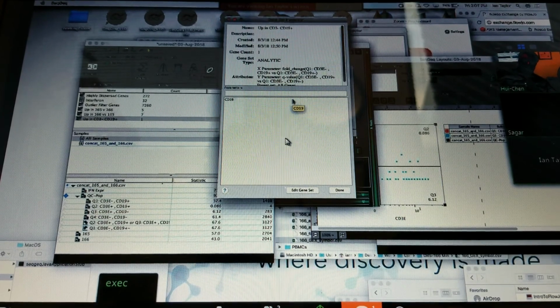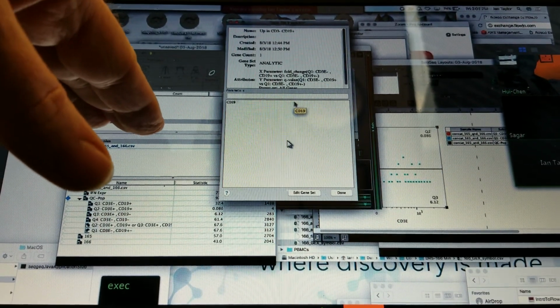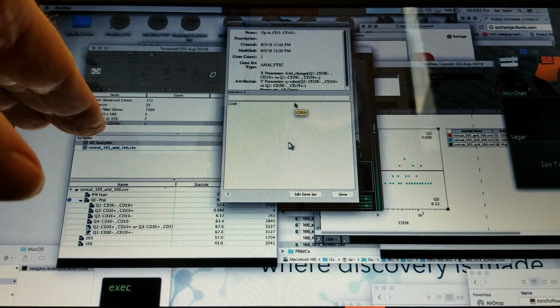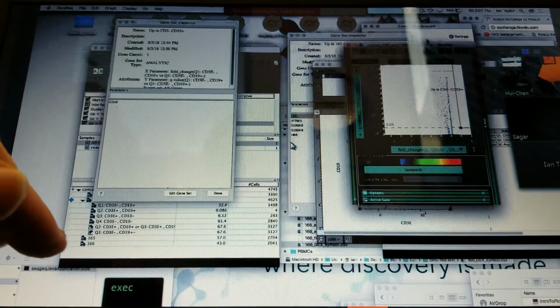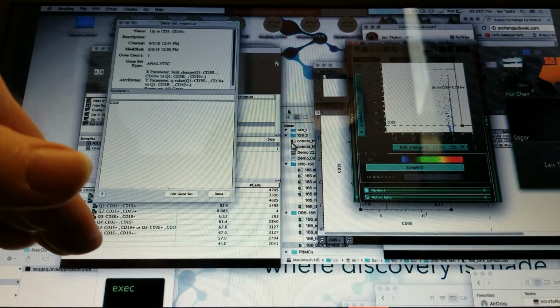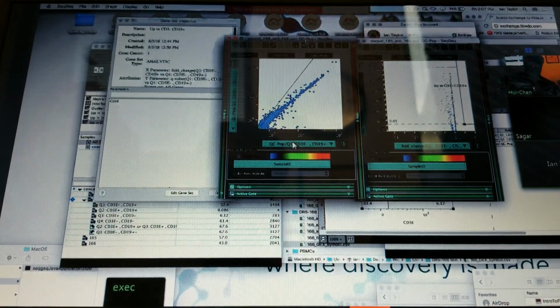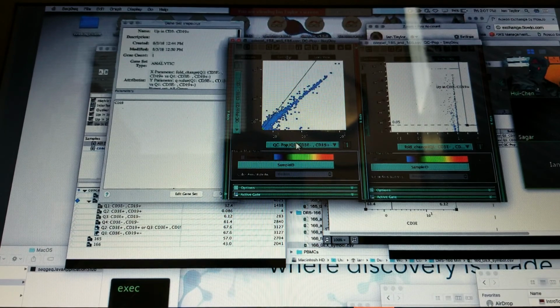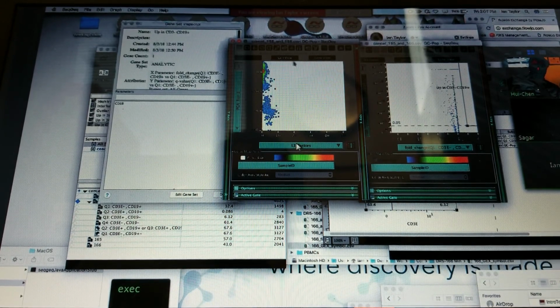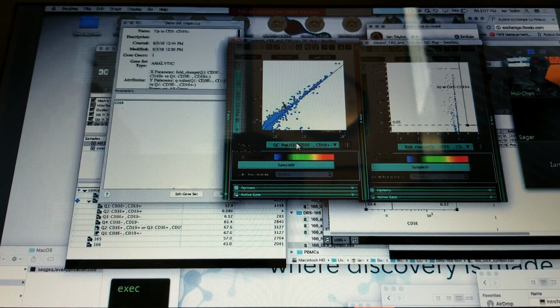How did you get it to gene? Because I see it up here. There's one gene, but now it's up there in the gene view window. That's a key thing. How did you get it from the lower window to the gene view window? Yeah, so it's just these two tabs at the top. If I switch to cell view, I'm now looking at cells, and if I switch back to gene view, I'm now looking at genes.